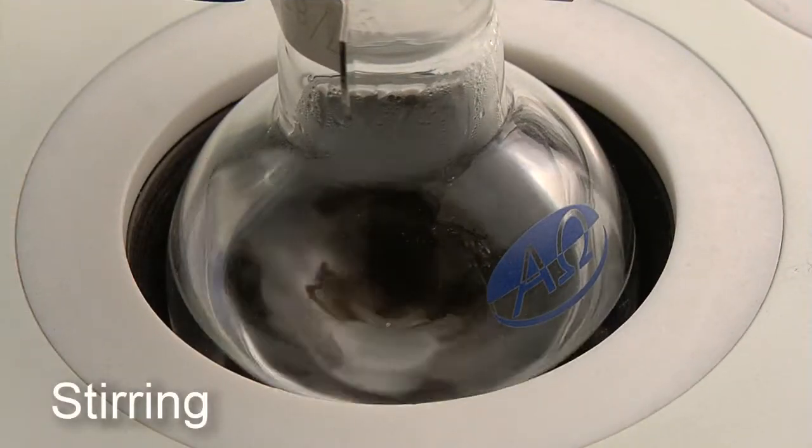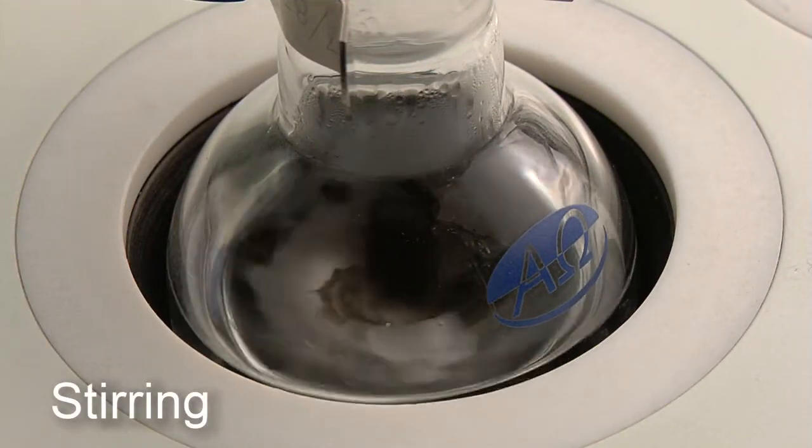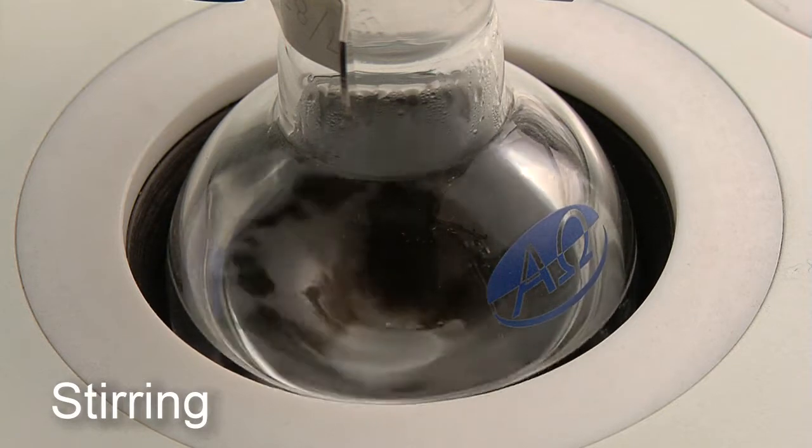Pro7 stirs the mixture evenly with a magnetic stirrer. The stirring speed ranges from zero to 1500 RPM.